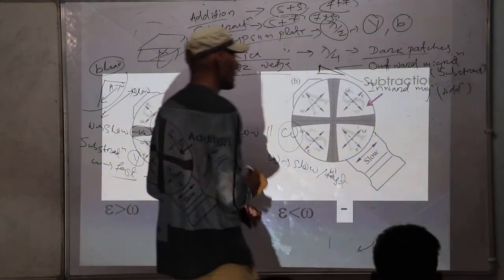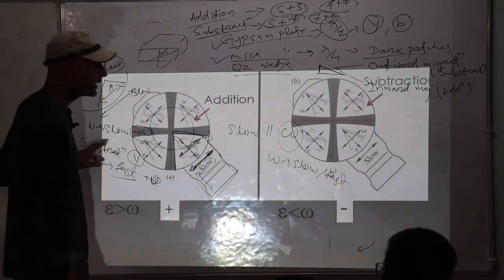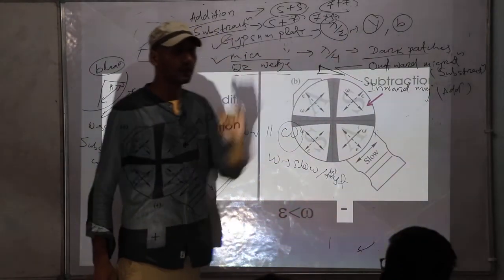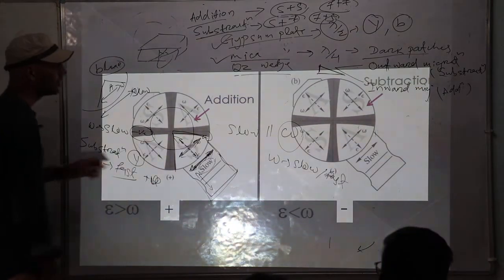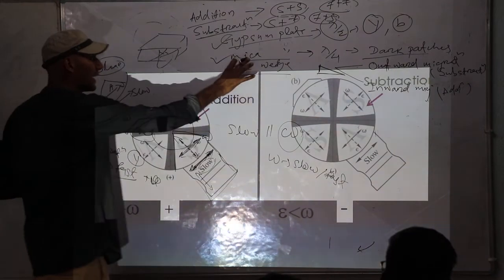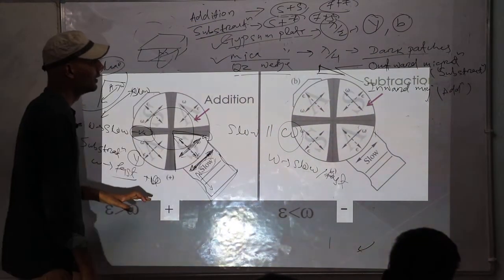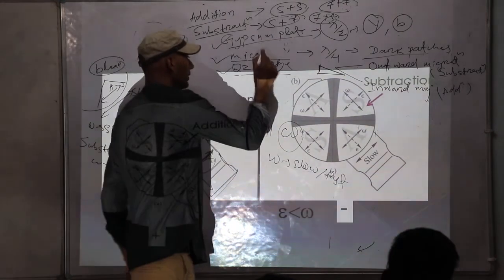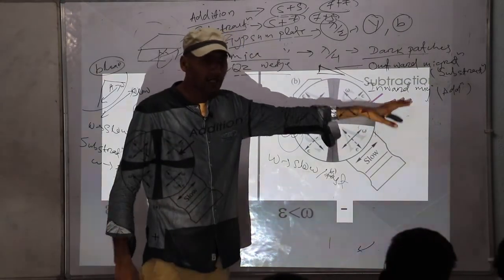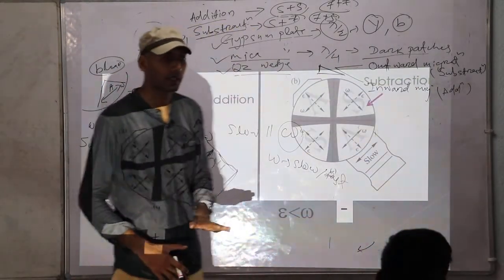So if you are watching addition of color, you will see blue color. If there is subtraction of color, you will see yellow color if you are using a gypsum plate. If you are using a mica plate, you can see dark patches in the place of subtraction. If you are inserting a quartz wedge, you can see inward migration or outward migration in addition or subtraction respectively.